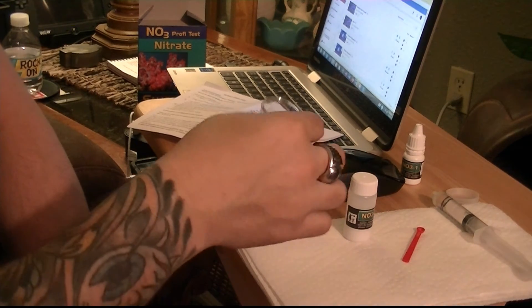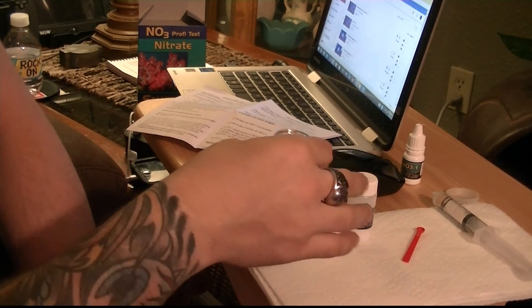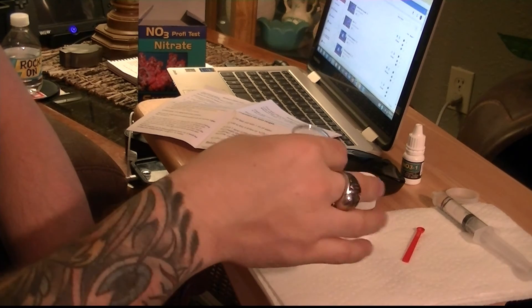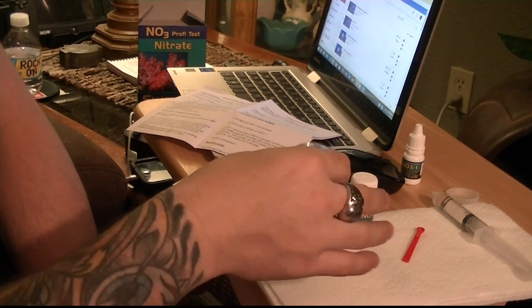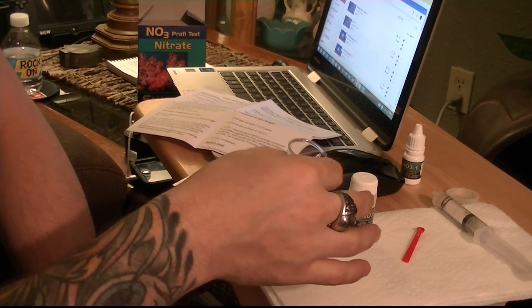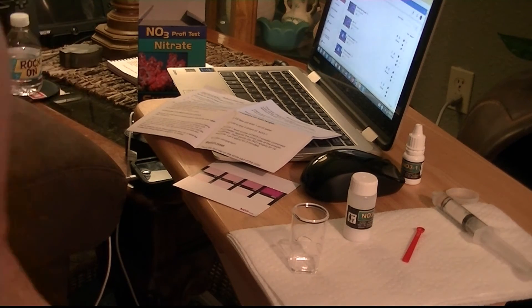So now we're going to swirl for 30 seconds. Okay guys, so now we have to let it sit for three minutes.